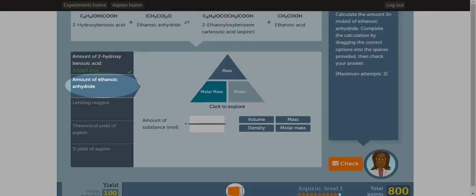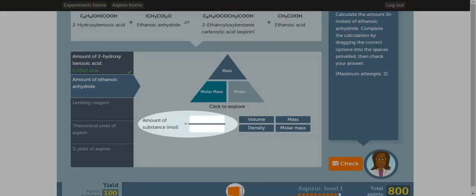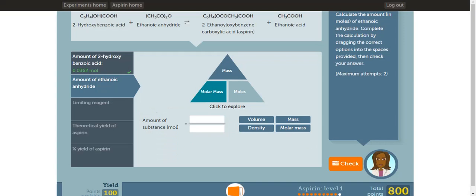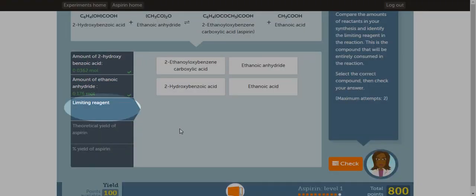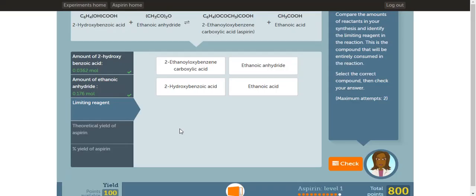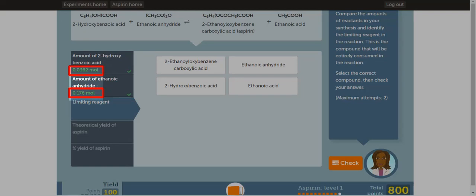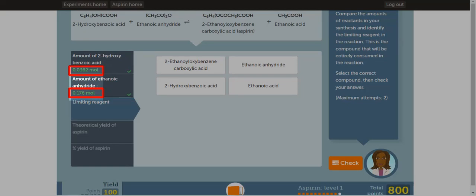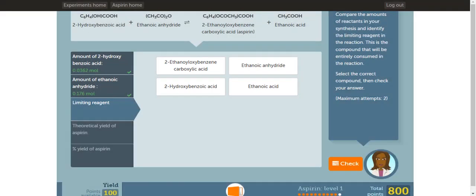In the second part of the activity, you'll be calculating the amount of moles for the second reactant. Again, you'll be dragging boxes into the equation to figure out the relationship between mass, moles, and molar mass. Once you're done, click check. In the third part of this activity, you have to figure out the limiting reagent of this reaction. To do that, analyze the mole ratio in the reaction. Then look at the moles of each reactant to determine the limiting reagent. Once you determine it, click the correct compound and click check.